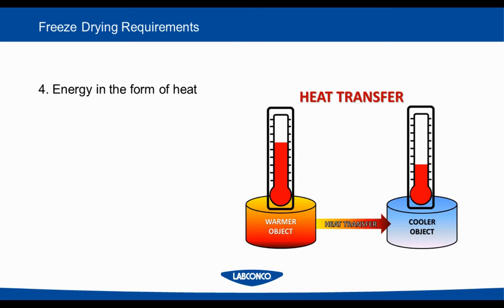The last requirement for freeze drying is having energy in the form of heat. While it might seem counterintuitive, the lyophilization process is essentially a heat transfer process. It's important to note, though, that if you add too much heat to certain samples, you could cause those samples to melt and undergo evaporation.